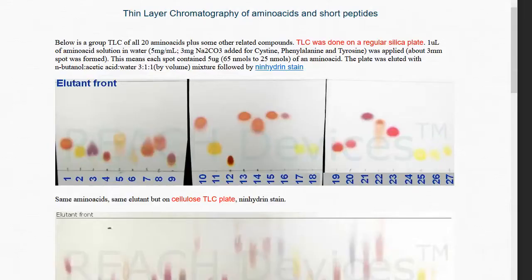So those are the amino acids that we will be comparing to and what could potentially be our unknown amino acids. All right, looking at this in a little bit more depth, there are several ways we could run this experiment. We could run it on a regular silica gel plate like we did within organic chemistry. One issue is that a lot of times we're not going to have much differentiation in RF values if we run it on a regular TLC plate.